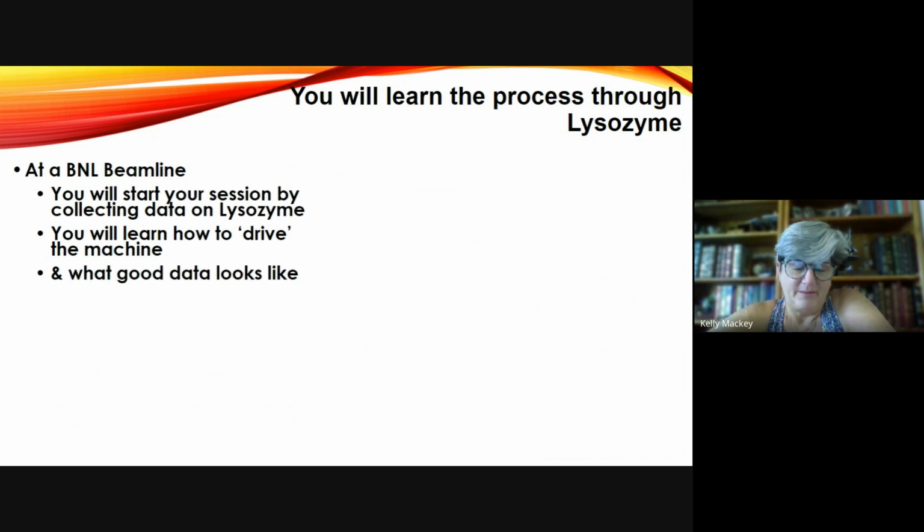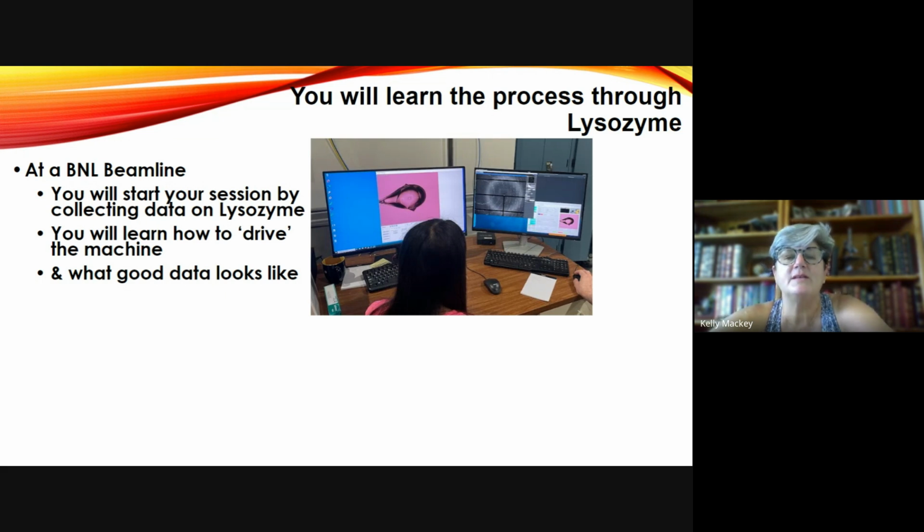It'll also, and this is probably the most important thing, show you what a good crystal looks like when the X-rays actually go through it, because we have spent a whole day, 6 hours shooting our experimental crystals and not actually seeing any good ones. And for a student who doesn't have that many beam times in them, it's kind of sad. So here is, we did this in June and it worked really, really well.